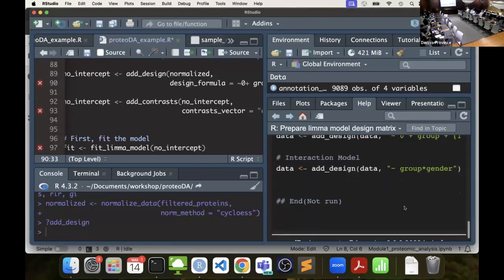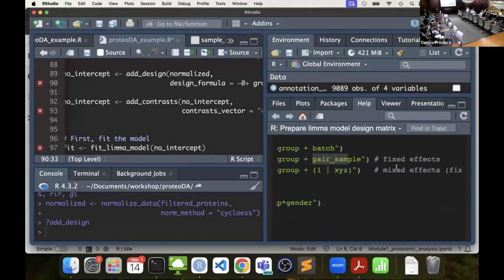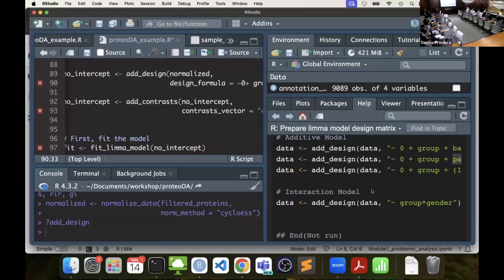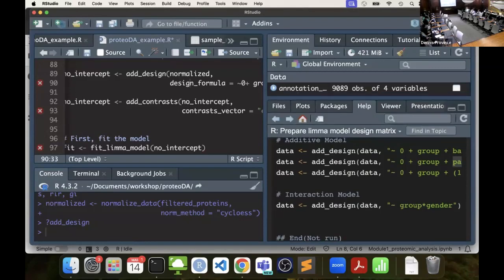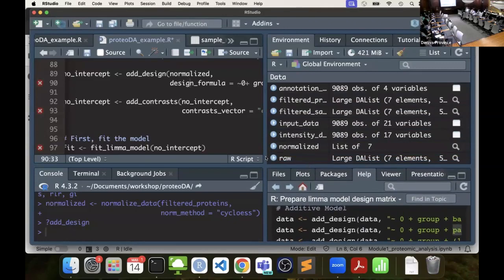So pairing is a different model for sure. So I have fixed effects, mixed effects. We're fixing in the paired sample. Here, we're making it just some random factor that's included. So fixed plus random effects. It hurts my head. But you need to be aware of it because if we run the models wrong, then it becomes not the correct interpretation.